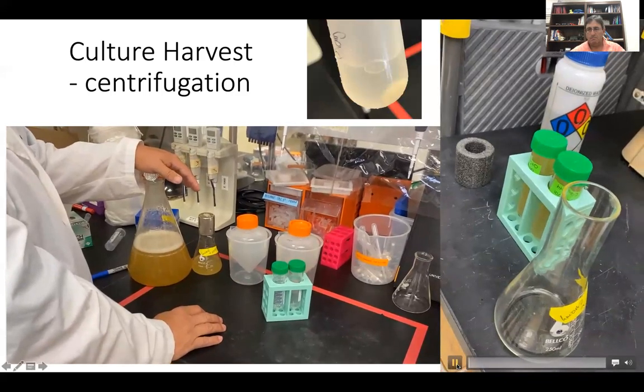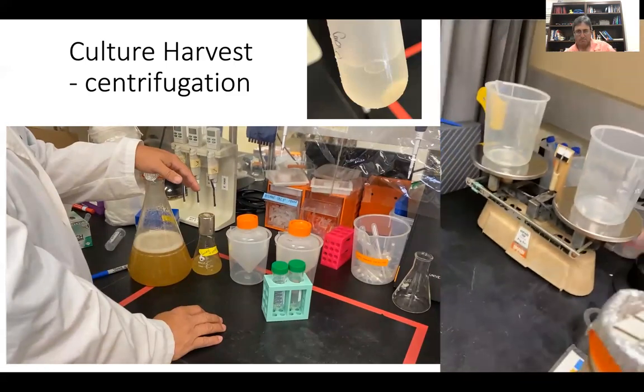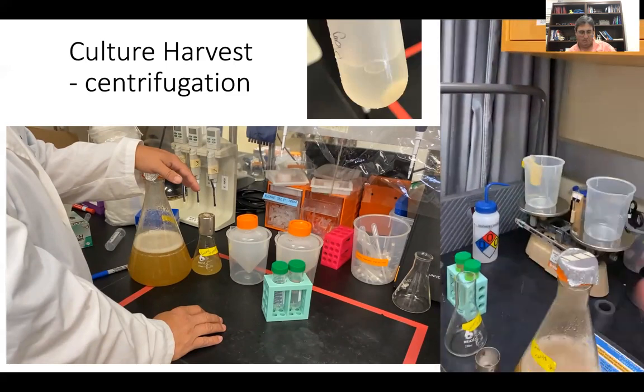All right, so now we've filled these and we need to balance them. You can either balance them on a digital balance or you can balance them on a pan balance like this, which our lovely assistant, Nate, hi Nate, is going to do. Go ahead, Nate.